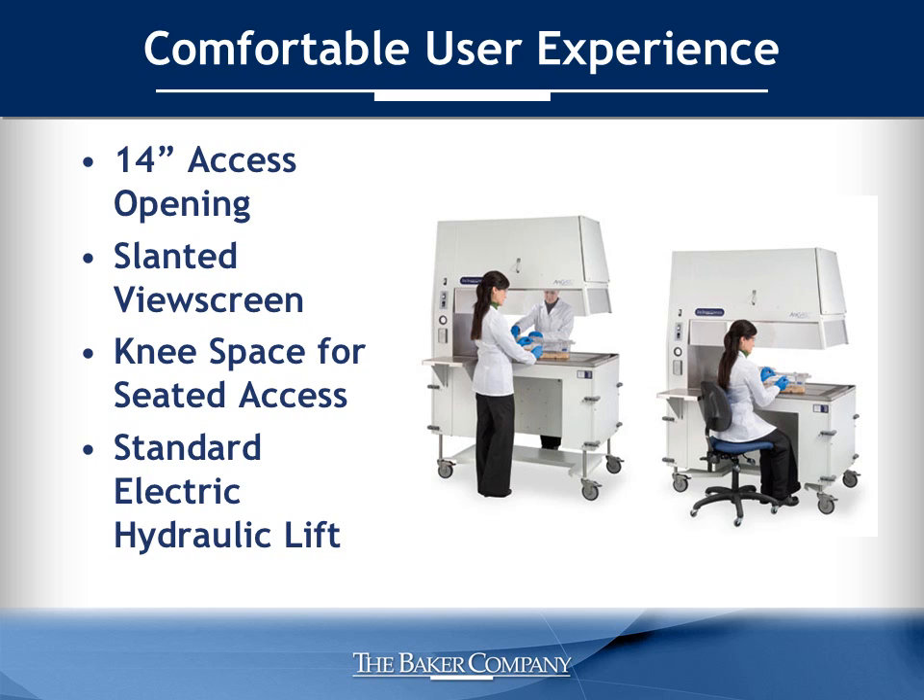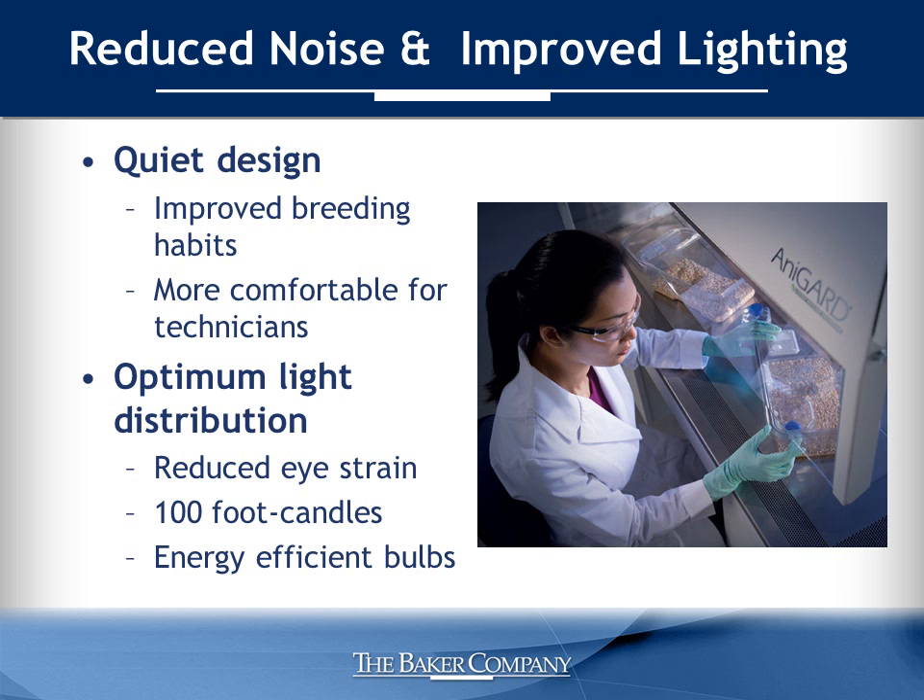We've enhanced the ergonomics of the AniGuard E3. The 14-inch high access opening to the work area accommodates a variety of cage sizes. The slanted view screen on three sides of the cabinet provides a direct line-of-sight panoramic view. A 12-inch knee space opening provides seated access for small procedures. An electric hydraulic lift comes standard and allows a work surface adjustment range to accommodate various sized operators comfortably. The AniGuard E3 was specifically designed to reduce noise levels and provide optimum lighting, both an important component of user comfort. Sound levels were measured at 59 dBA using NSF protocol and 57 dBA using EN protocol.